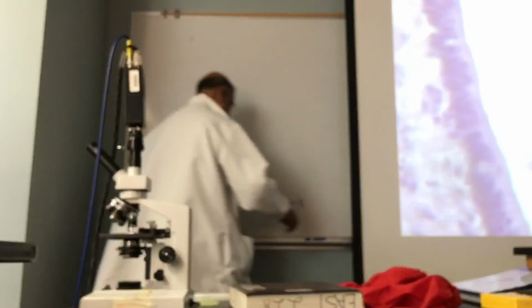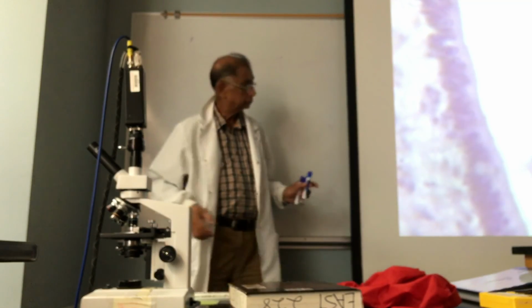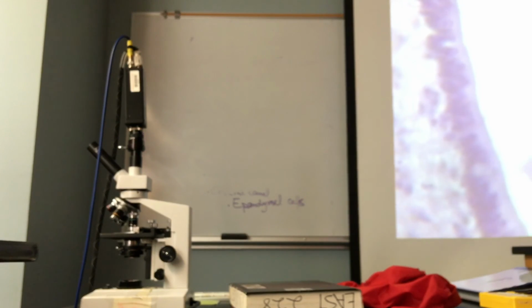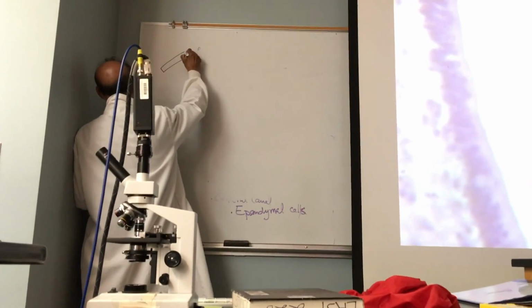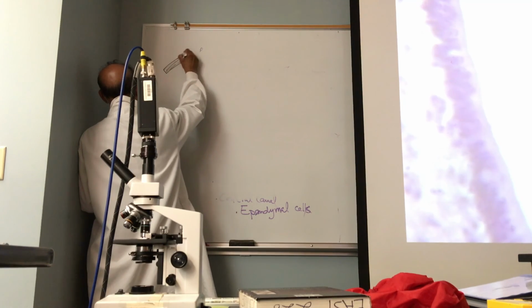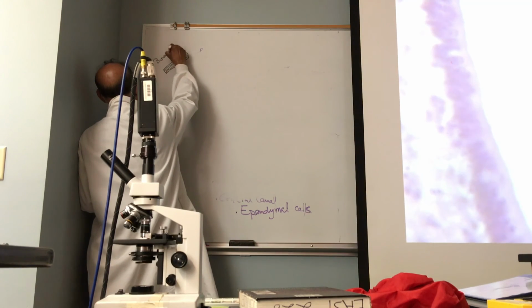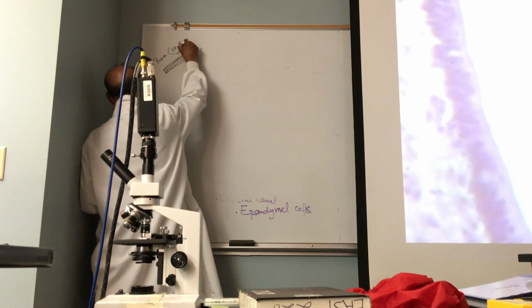Okay, let's see. Is there any black? Say, this is the bone. It could be skull or vertebra.